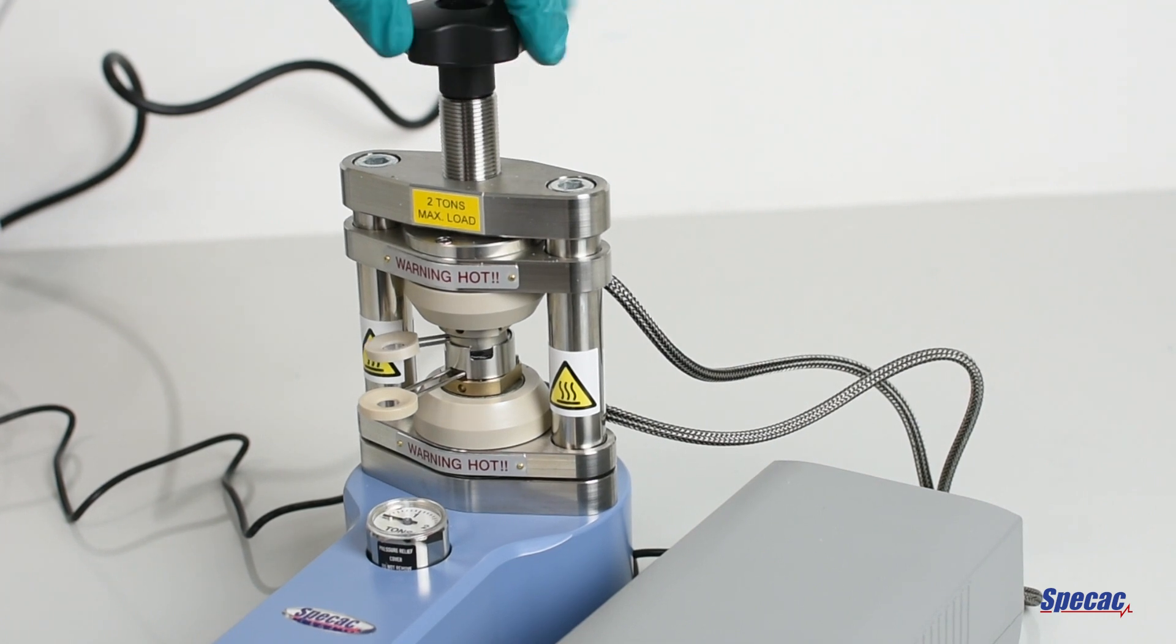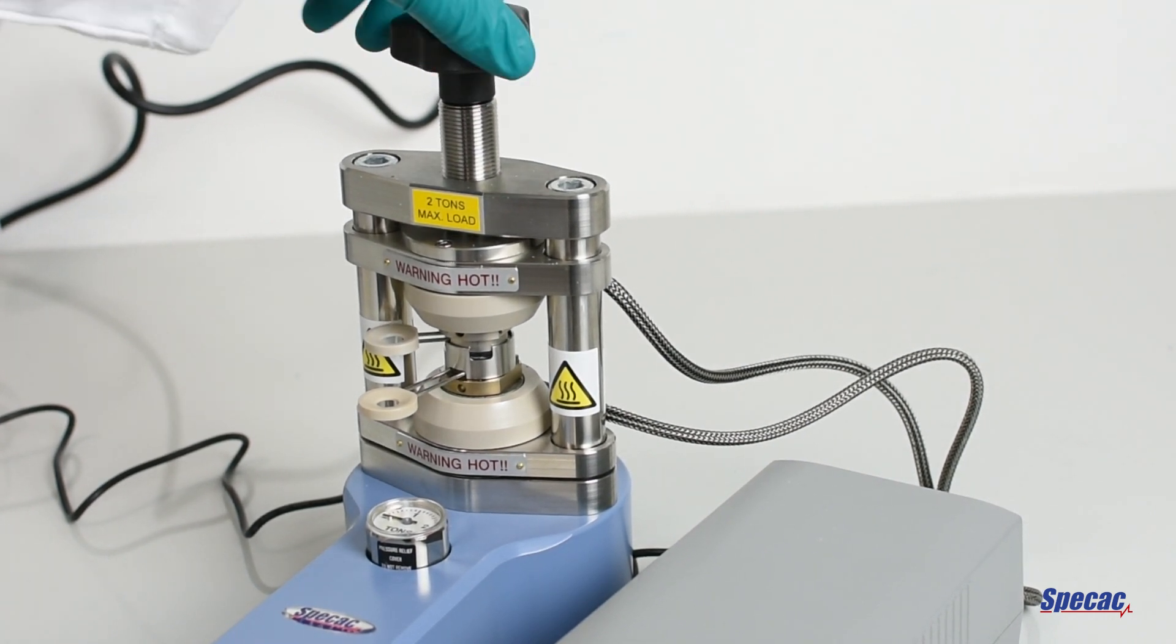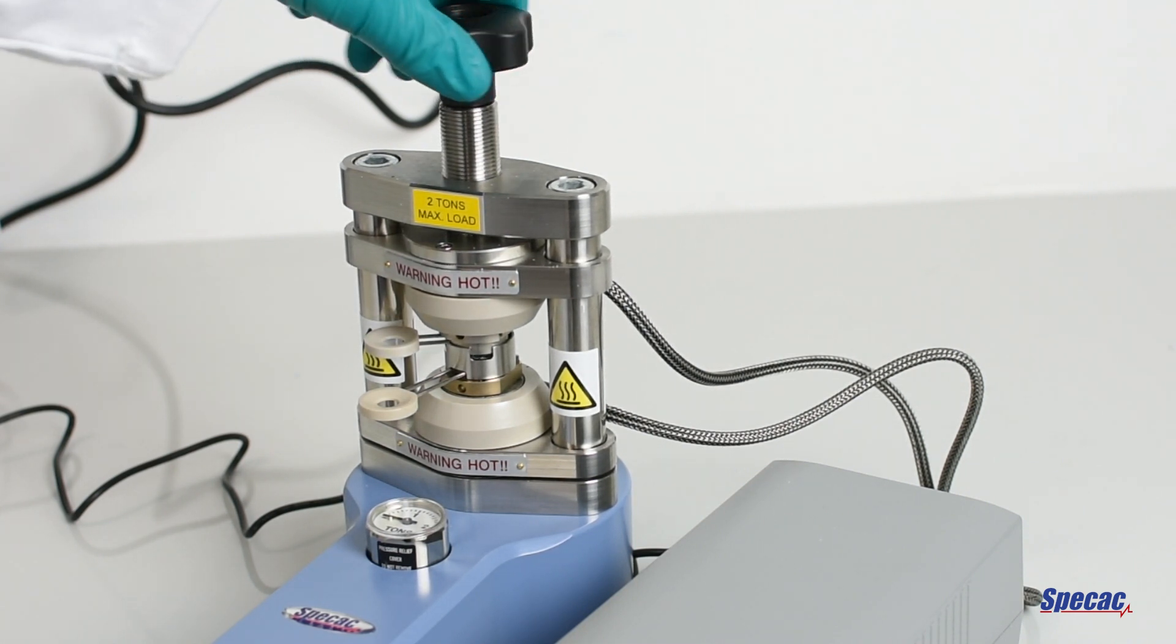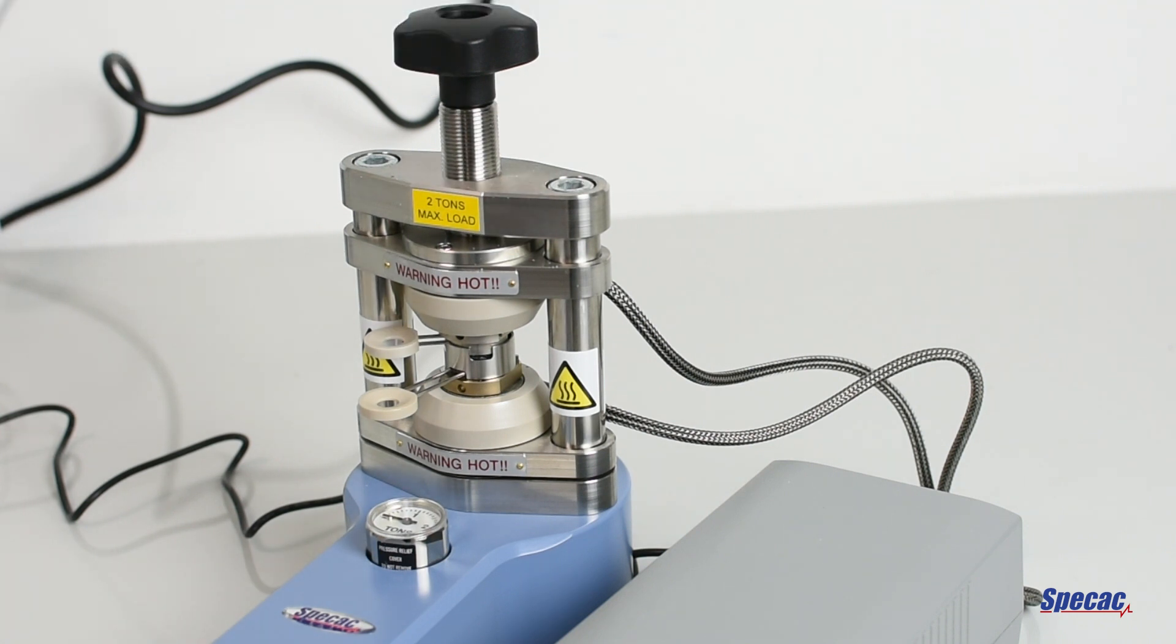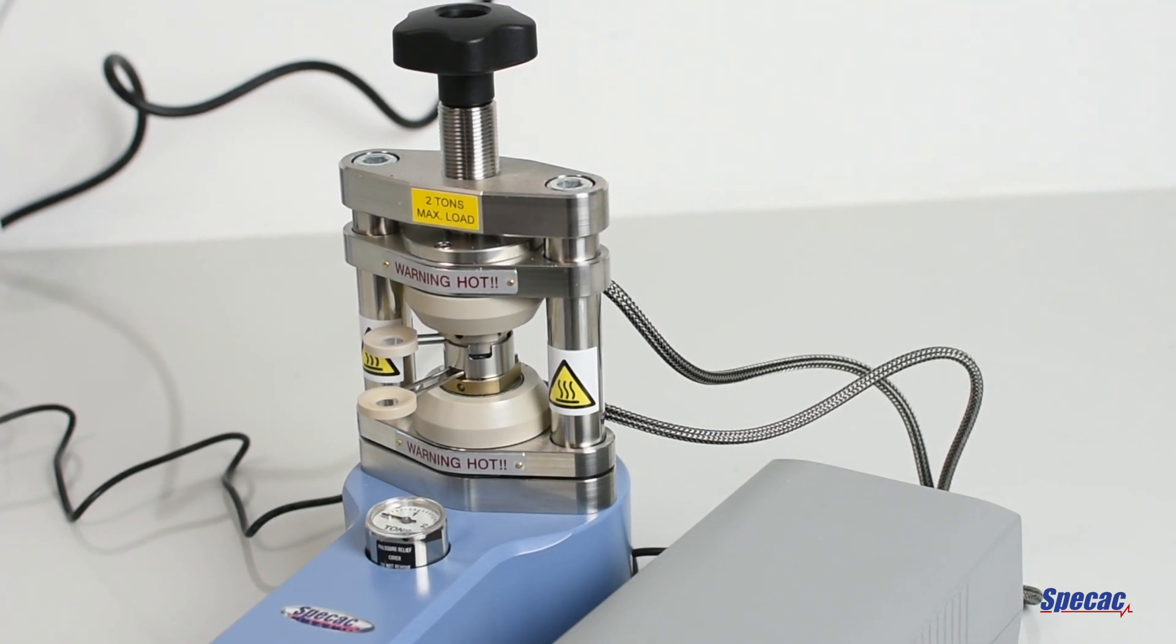Turn the lead screw knob clockwise to bring the top heated surface into close contact with the film maker parts to begin the process of heat transfer to the polymer sample. Initially, there will be a reduction in the actual temperature display value as the cold film maker assembly is introduced into the hot environment, but the assembly will return to the set temperature value within a short time.